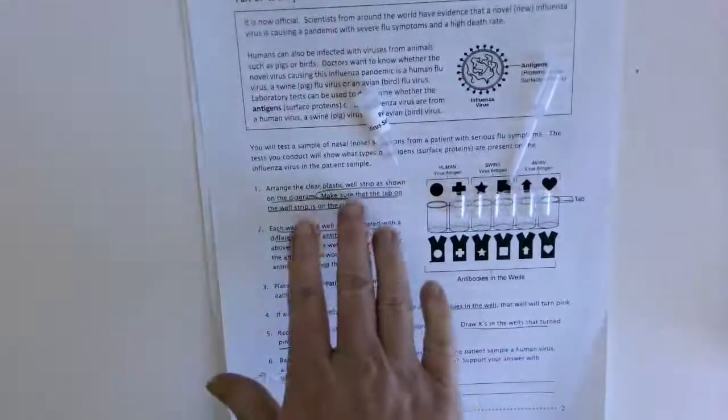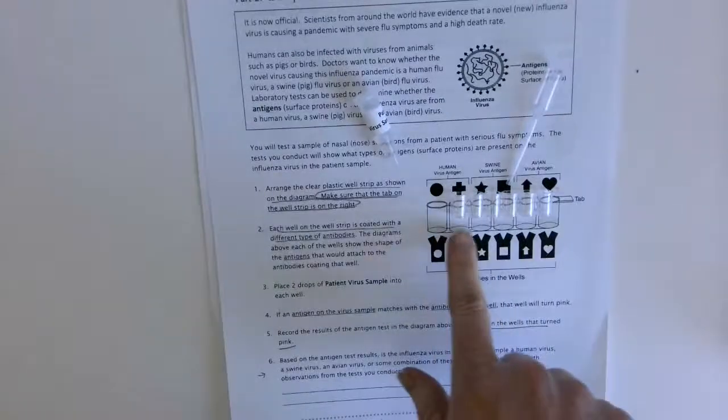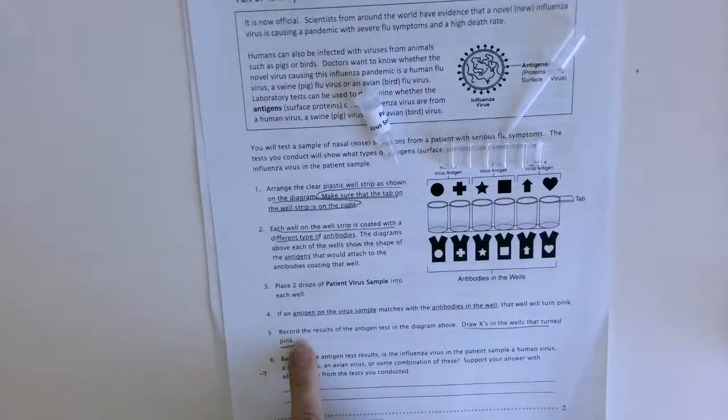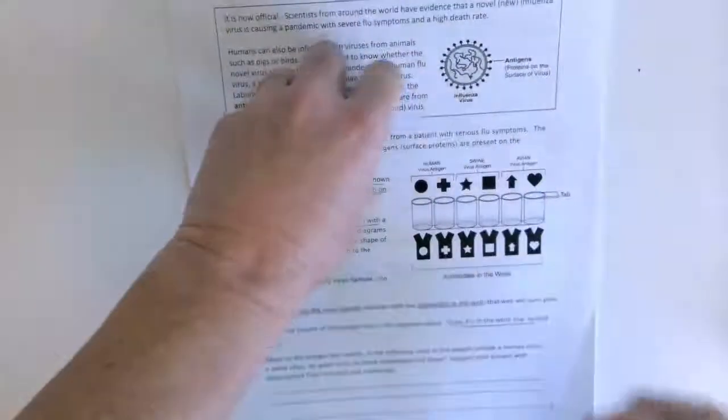So there is some important reading steps here that I'll need you to look over. And you're going to draw X's on the wells up here on your paper version for the ones that changed to a pink color. So let me see if I can move the camera down a little bit so you can see that direction, the ones that turned pink. Okay, then you're going to do some analysis on that.